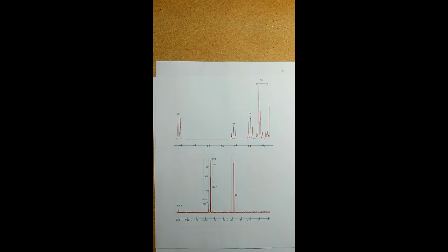Alright, now we're going to begin our final step here, looking at carbon NMR. So I just wanted to quickly show you our location here down at the bottom. This is our graph for carbon NMR. Again, as you can see, like in our proton NMR, there are 3 groups here that could be expanded to show us a little bit more information, and I'm going to go ahead and show those to you now.